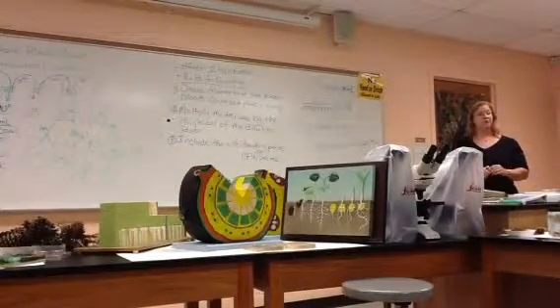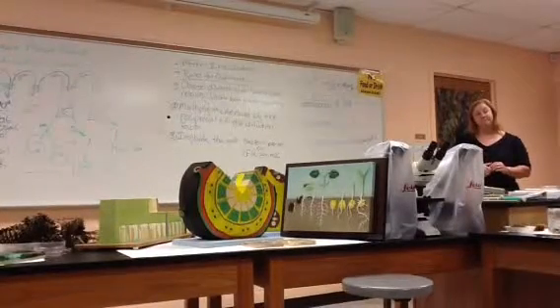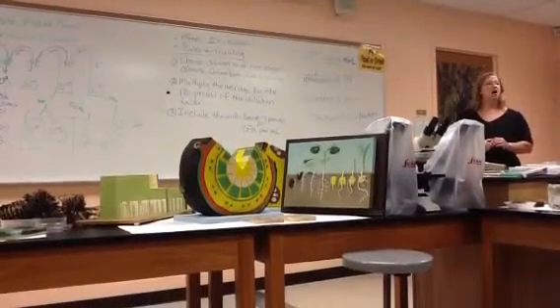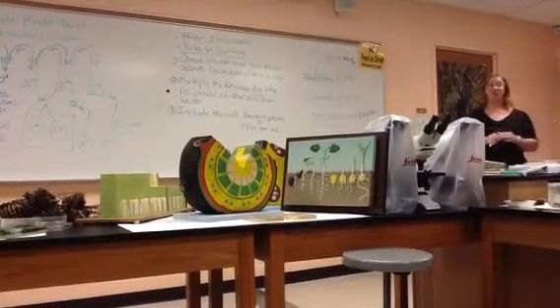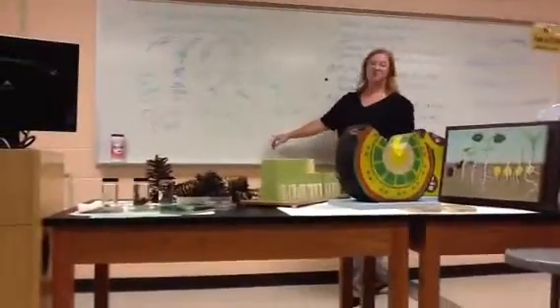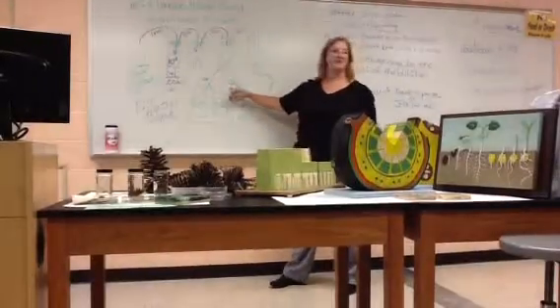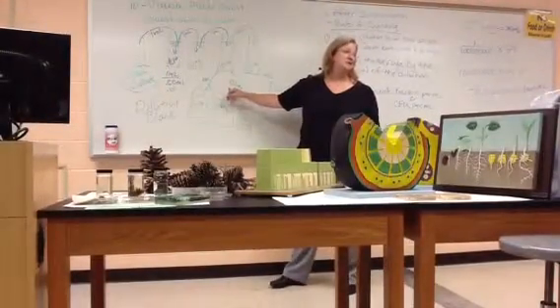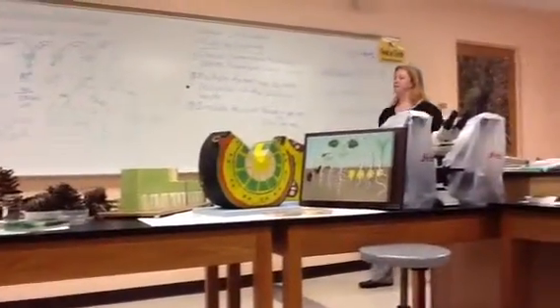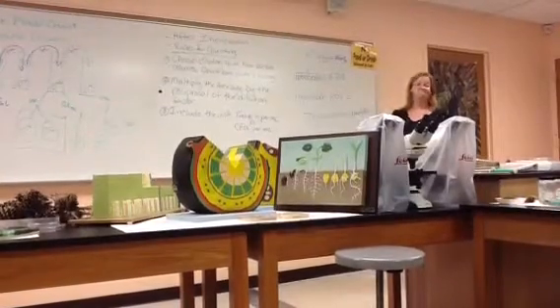So we feel comfortable with that? What about the 10 to the -7, 0.1? You'd still do per mil. Because the only reason, if we had made a 10 to the -7 dilution, we would have put a mil on that plate. We just cheated and didn't make a separate bottle. Does that make sense? So it's still per mil, that's a good question. It's still per mil. And also because the original stock culture, we pipetted a mil out of it.